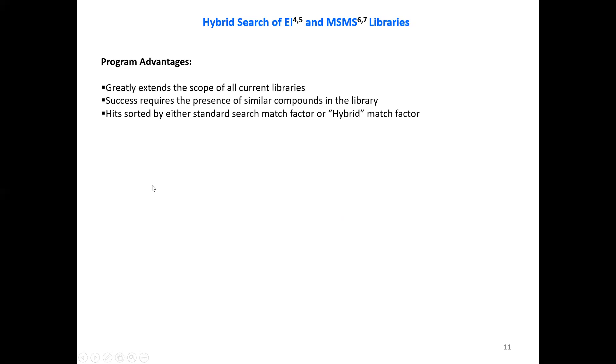So let's take an example to illustrate this. But first let's talk about the program advantages. The program greatly extends the scope of all current libraries. The success requires the presence of similar compounds in the library. Hits are sorted by either standard search match factor and then also the hybrid match factor. You can resort the results automatically just by clicking on the top of the column. And the delta mass reflects the modification of the model molecule.